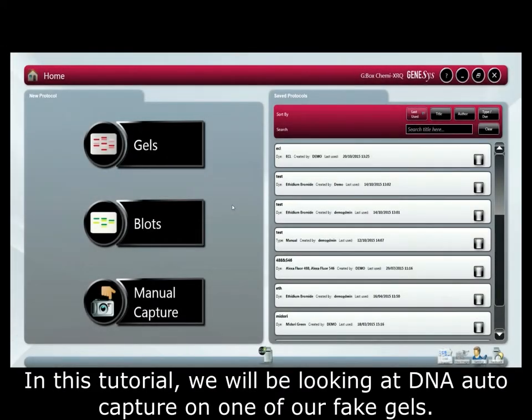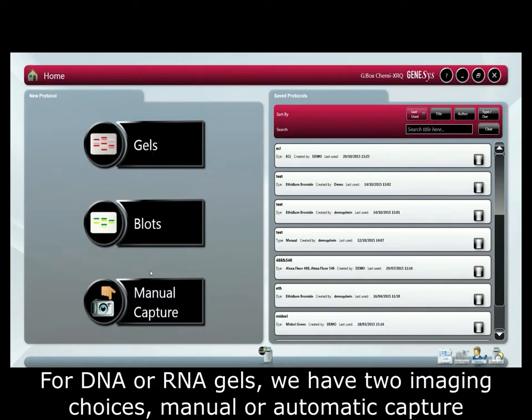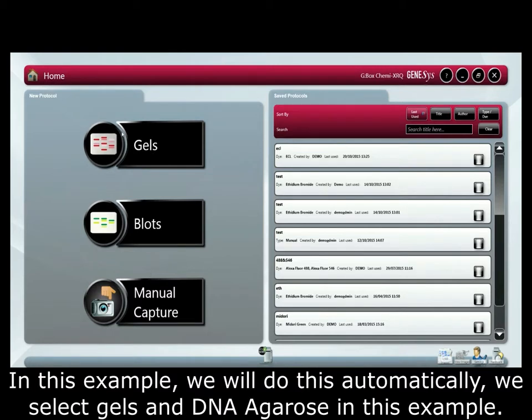In this tutorial we will be looking at DNA auto capture on one of our fake gels. For DNA or RNA gels we have two imaging choices, manual or automatic capture. In this example we will do this automatically.